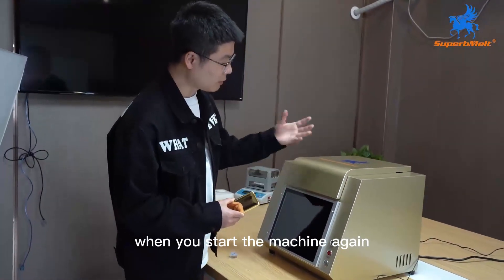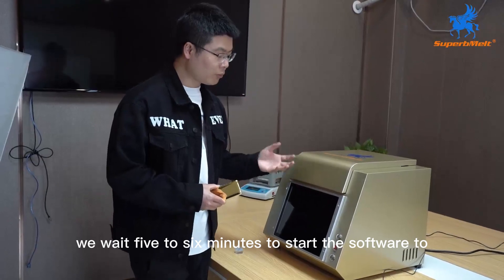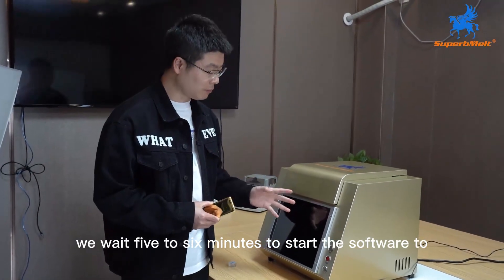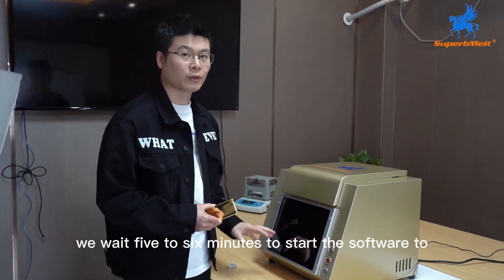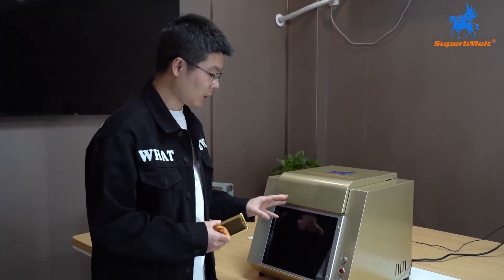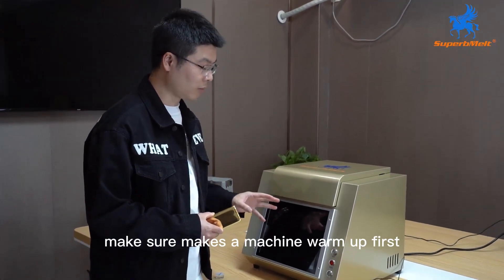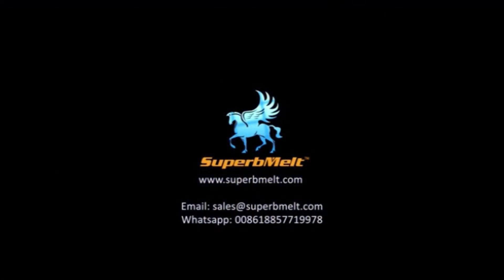When you start the machine again, we wait 5 to 6 minutes to start the software to make sure the machine works properly.